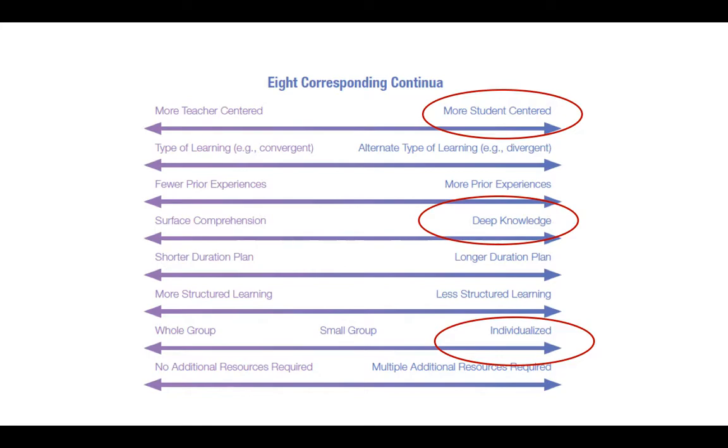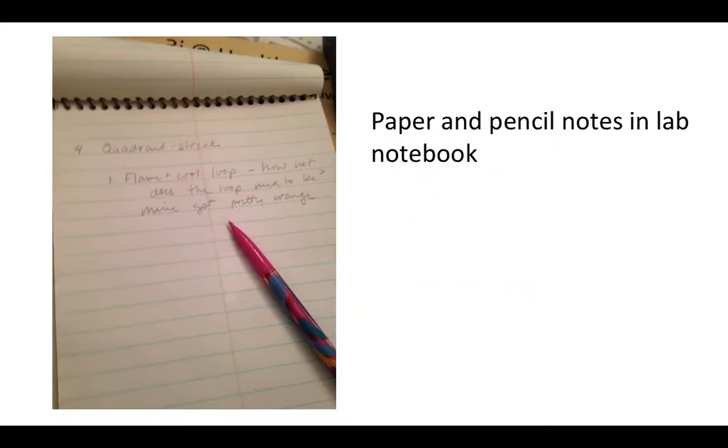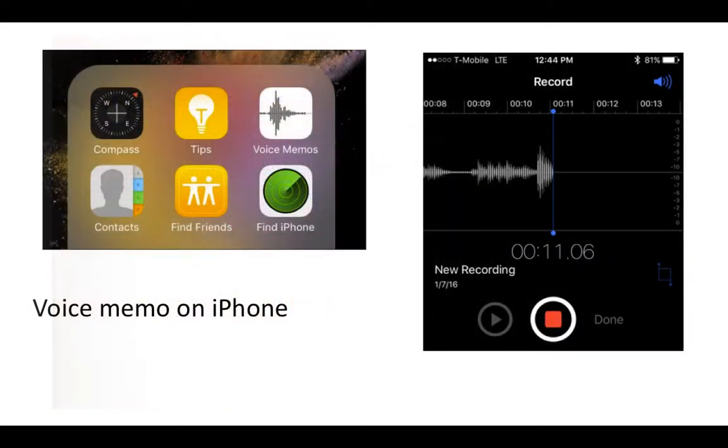With our traditional lesson, we haven't provided a means for students to record their observations of how the procedure goes for them. Written notes could be used, but students often balk at providing much detail in written lab notes, so they may seem somewhat cryptic when read several days later. A voice memo would be much faster, easier, and provide more immediacy.